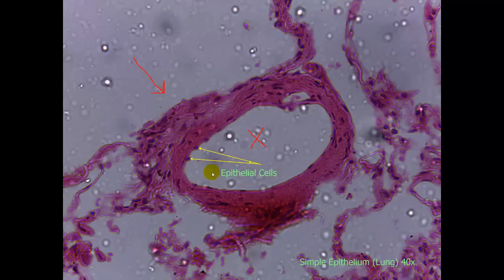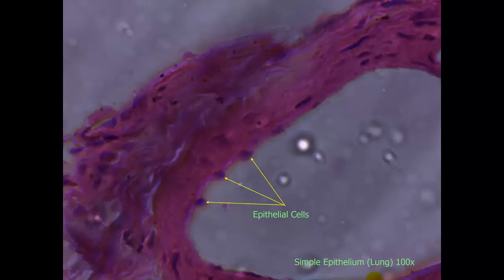On this first slide, we can see epithelial tissues. These are simple epithelial cells indicated by the arrows, and they are in fact lining a lumen indicated by the X. Here is the same tissue at 100x objective, which is the oil immersion objective. Here are the cells that were pointed out earlier — the simple epithelial cells, the rounded ones. We can also see at the bottom the squamous type cells as well.